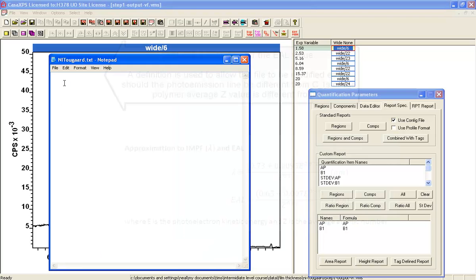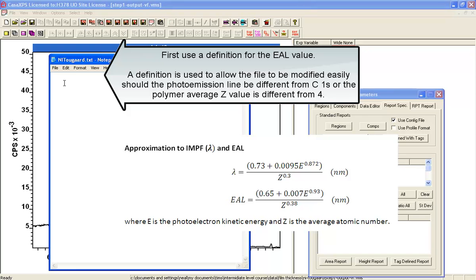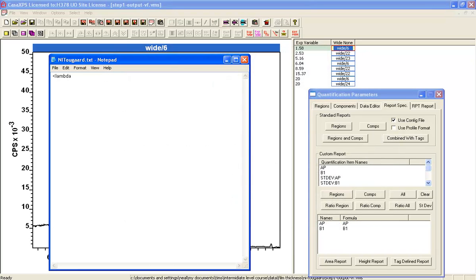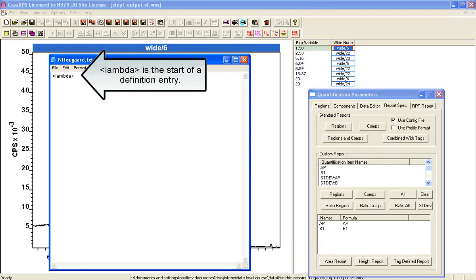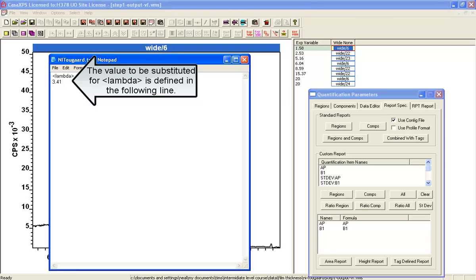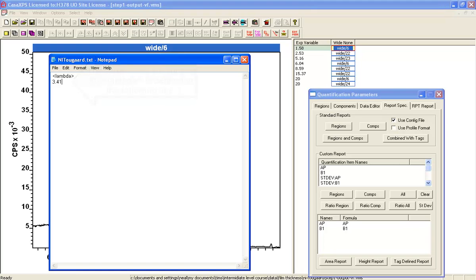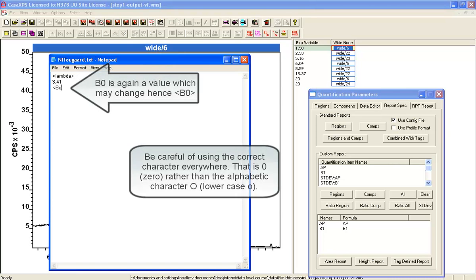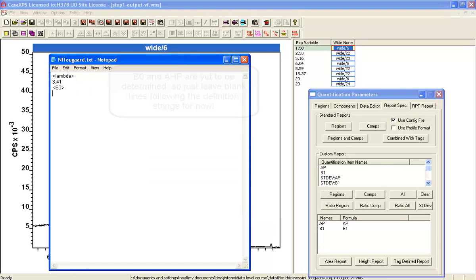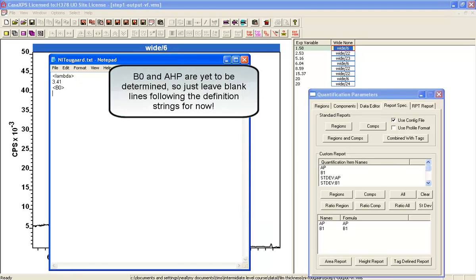We'll begin by saying we need to enter what we mean by lambda. We give it a string, that's a string of your choice, and then we'll give a value and we calculated 3.41 using the previous analysis for lambda. We need to set up a value for B0 and B0 will be the value for the parameter from a thick film of PP hex, and we'll also need a value for AHP which again is the area from the thick film PP hex. I'm yet to find out what these values are but we will enter them when we get them.